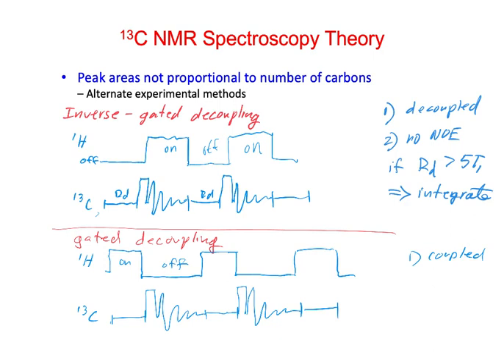Because if there's no decoupling, I guess the idea would be that you're turning on the decoupler. So probably, when they first did this, they called this extra radio frequency that was in the proton range the decoupler. So they're gating the decoupler, this transmitter that's in that range.